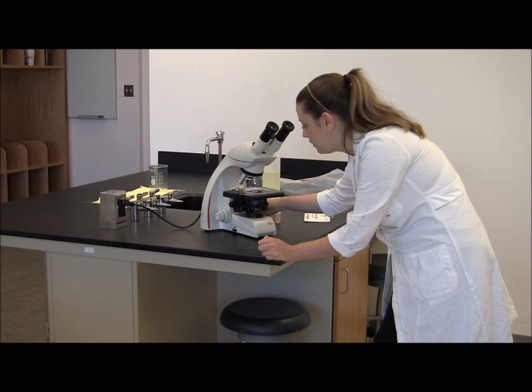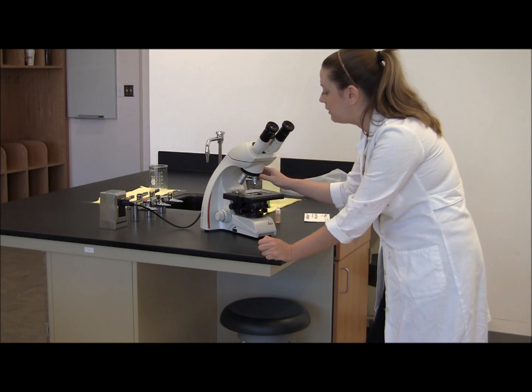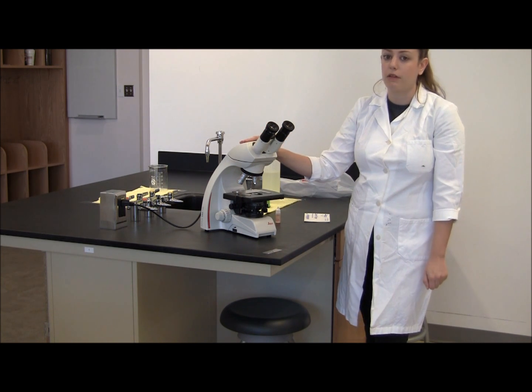Move the stage down to the lowest position and make sure that the lowest objective is in place before you put the microscope up for storage.